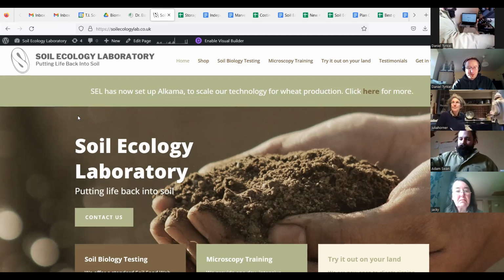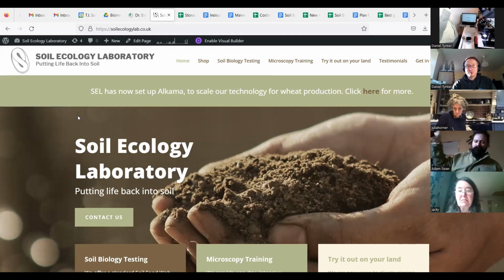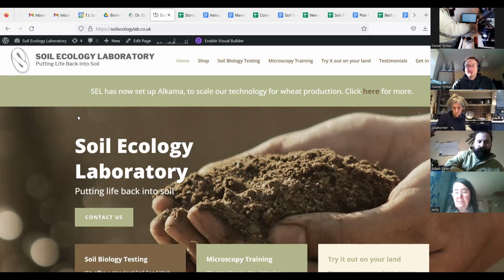Her work basically started off the real addition to the whole soil biology from the perspective of lab analysis, came early in the 80s.